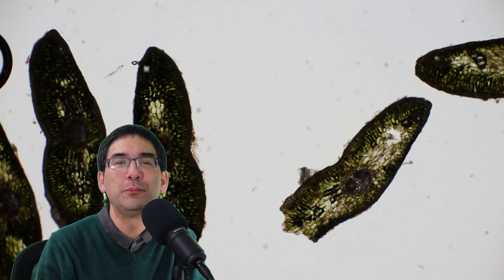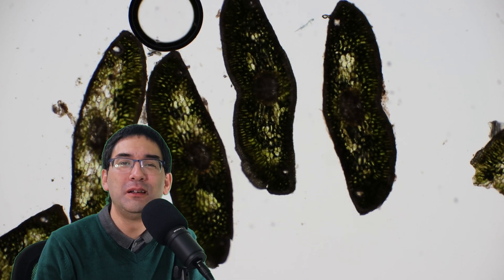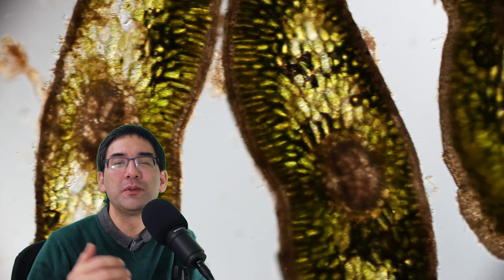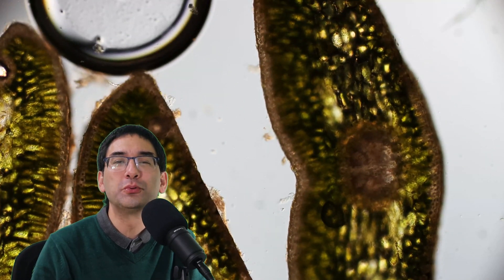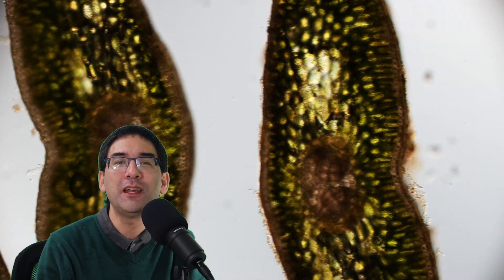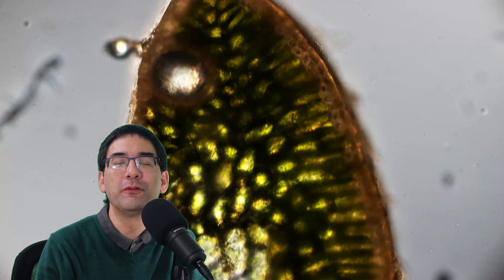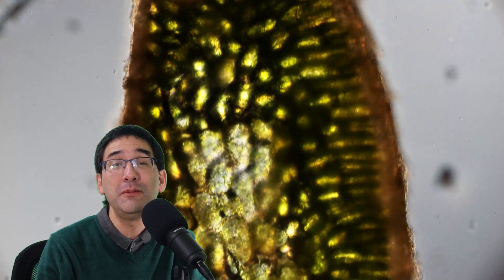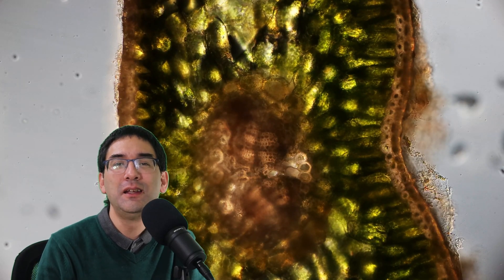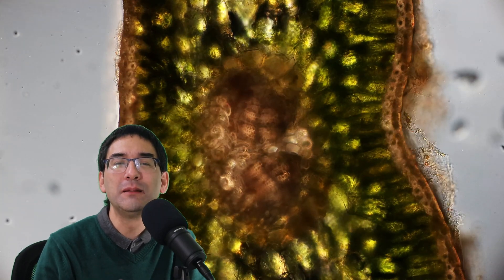The first impression was not very convincing. The sections were all relatively dark, not very interesting to look at, and the contrast was not very high — I was a little disappointed. Looking at a slightly higher magnification everything appeared a little brighter, but still far from ideal. The problem is there are too many pigments inside the needle, and I needed to remove the chlorophyll first to make everything more transparent.